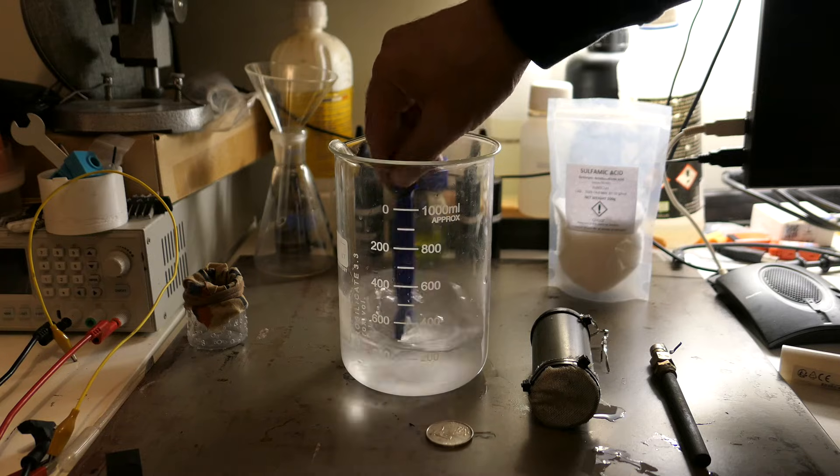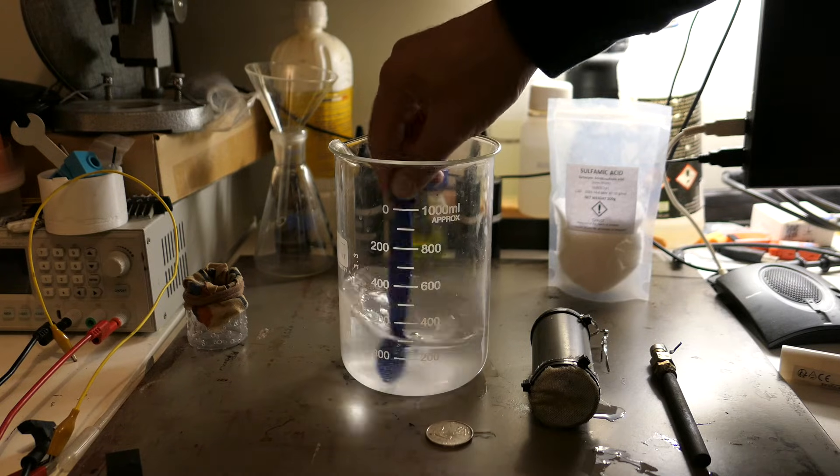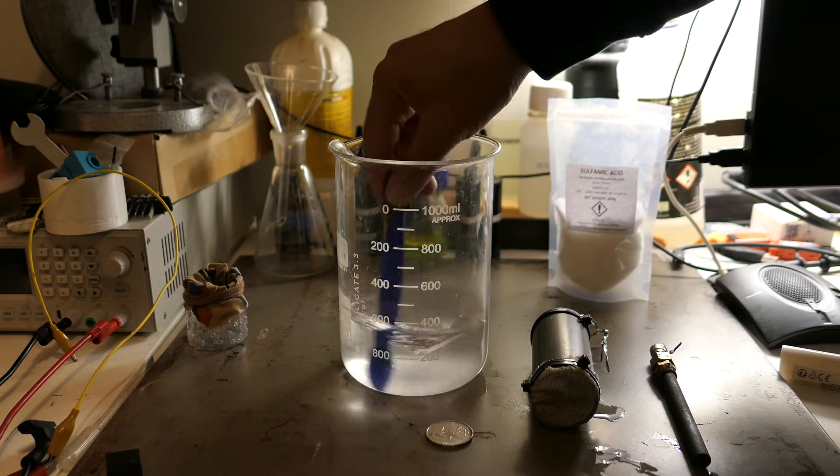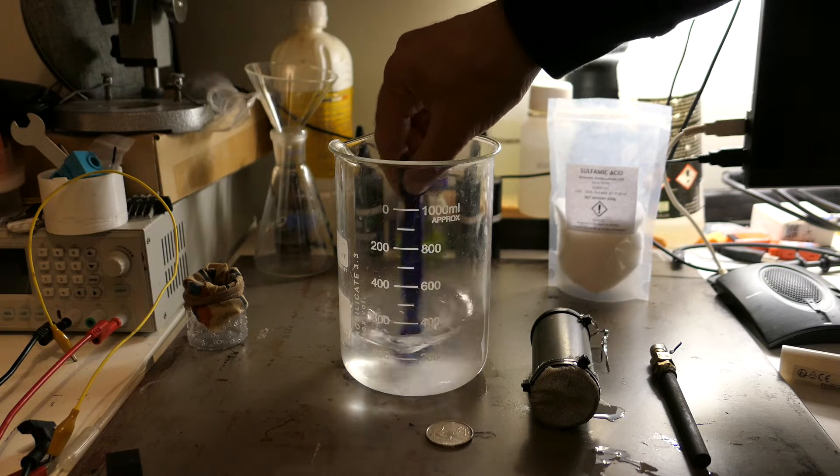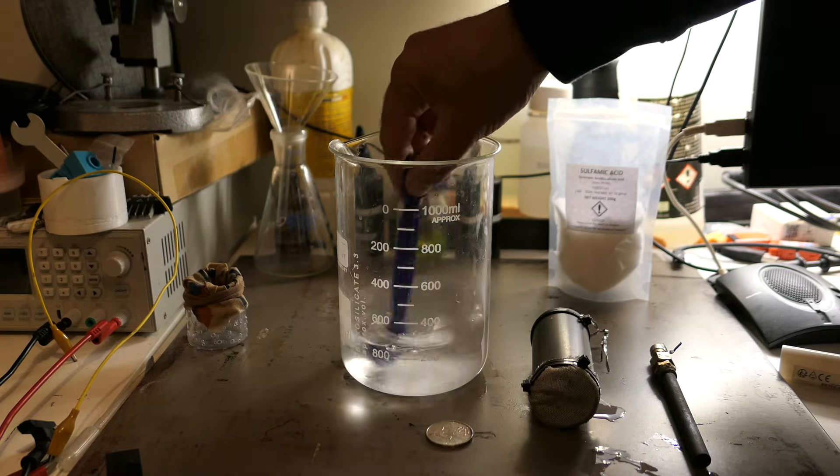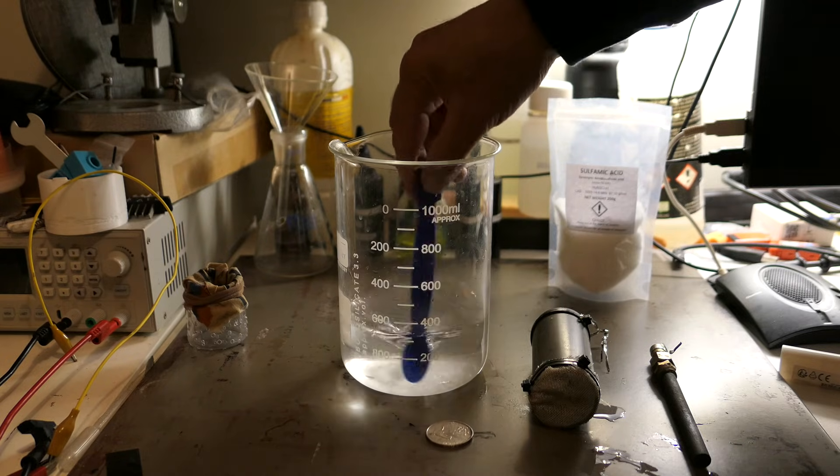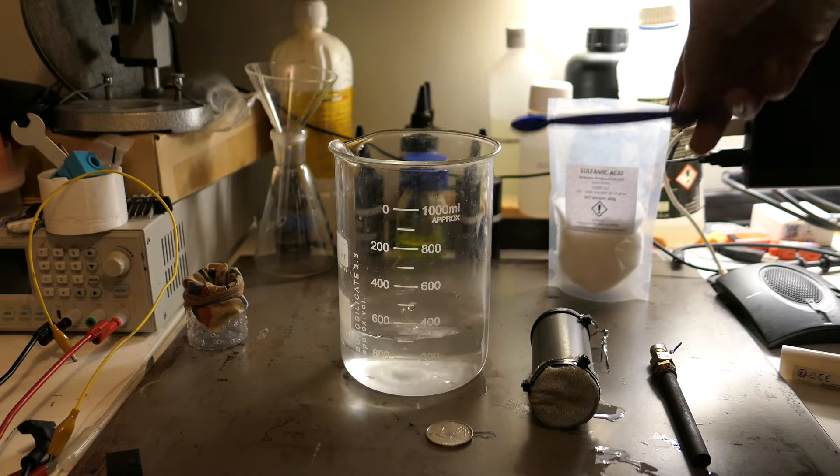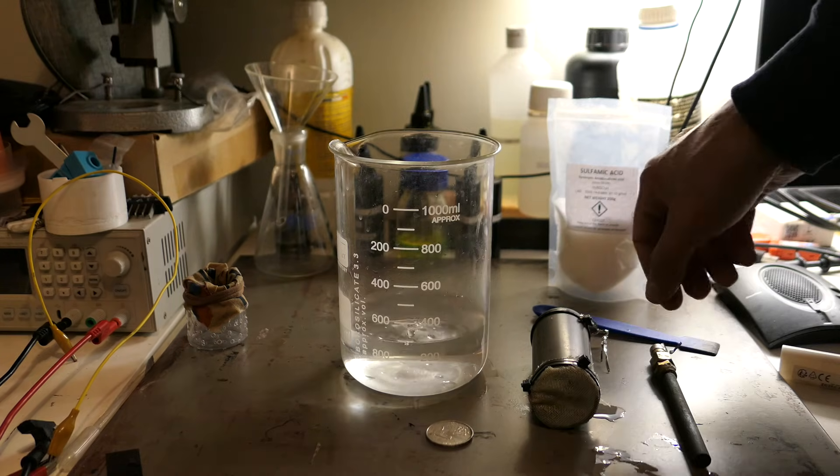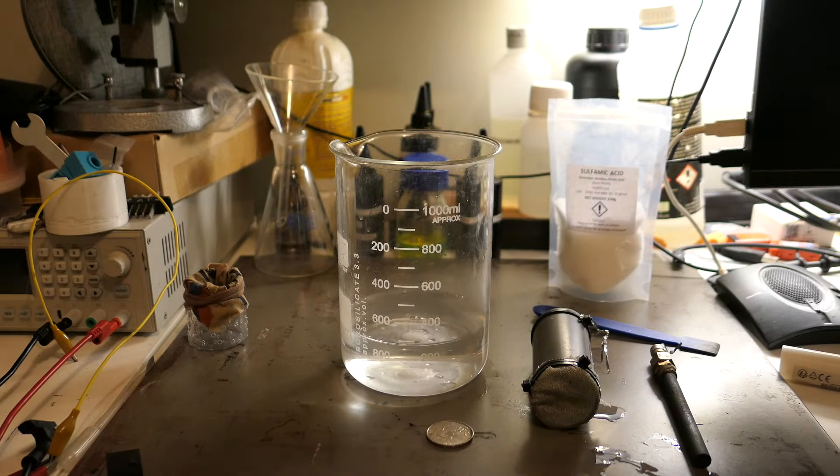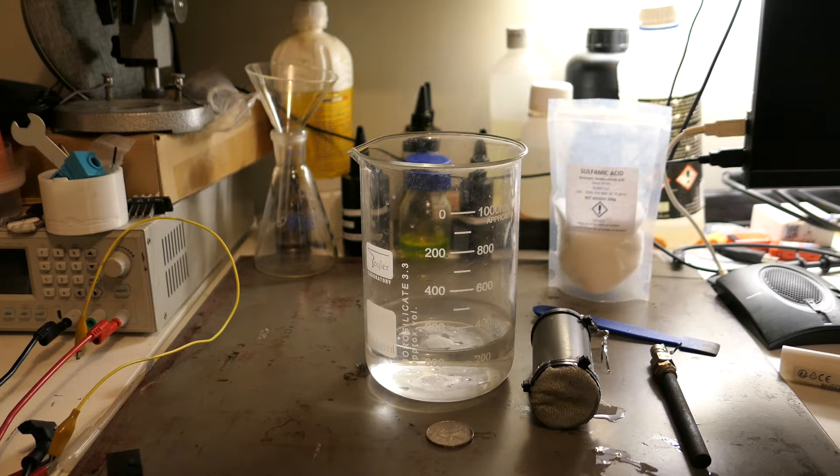Now the issue with the classic method is that it relies on nitric acid and silver nitrate. These chemicals can be expensive, hard to find, and not the friendliest to handle. Nitric acid in particular is quite corrosive and needs to be handled with care. So what if we could refine silver without needing those chemicals?